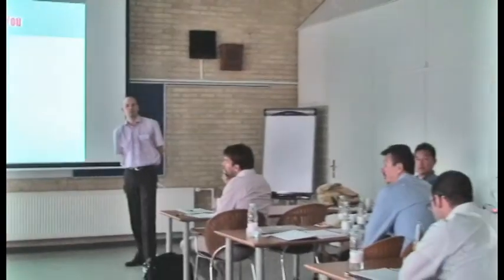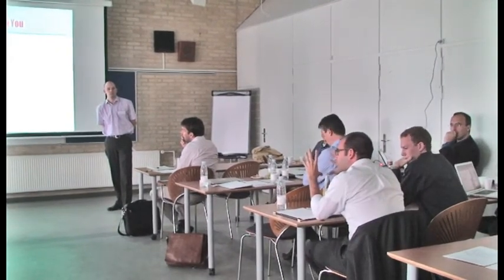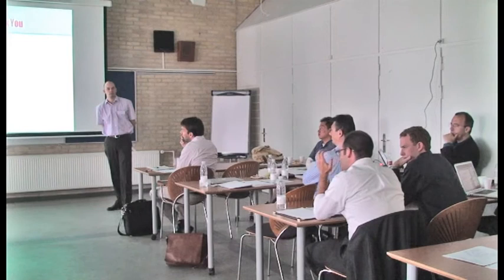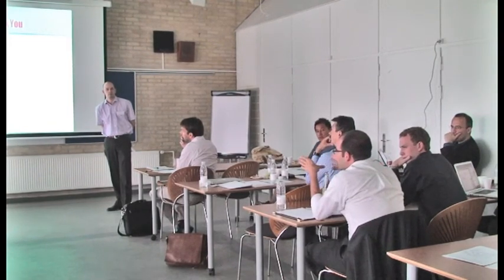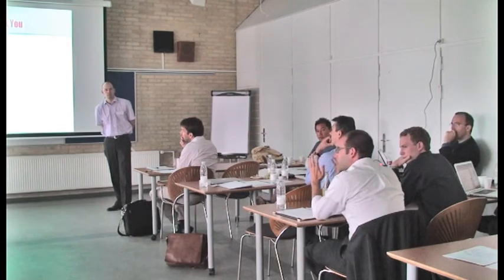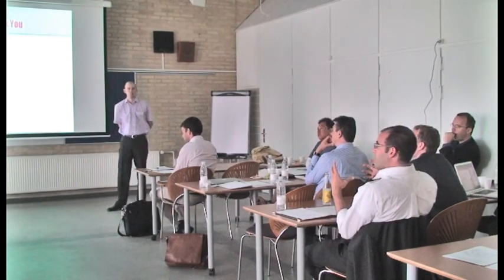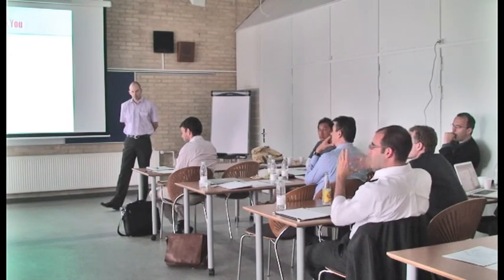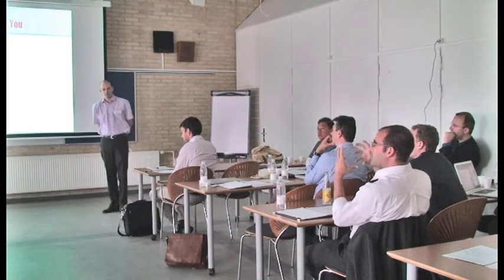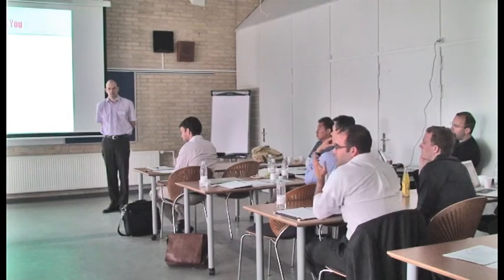James Wilson, Northwestern. Just thinking about your sample and coarsening effects, you might want to be careful that when you do the reconstruction, you look only at the interior structure of that pellet. Because it's possible that part of the coarsening that happens in nickel YSZ is that you're constrained by the YSZ structure. And if you're at the edge, these nickel particles on the edge might behave differently just because there isn't material there. So I don't know.